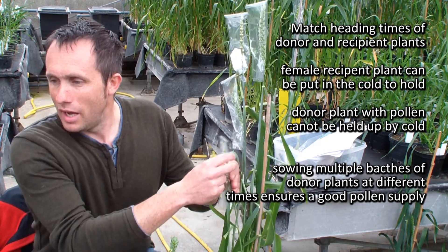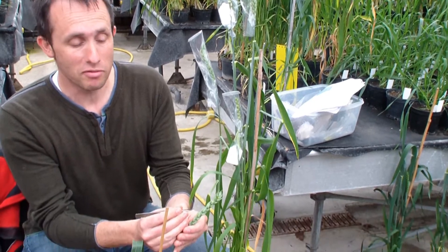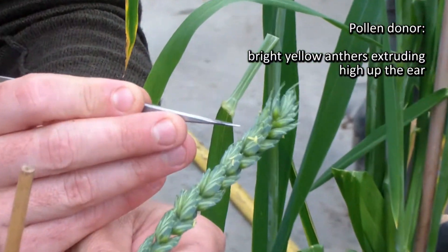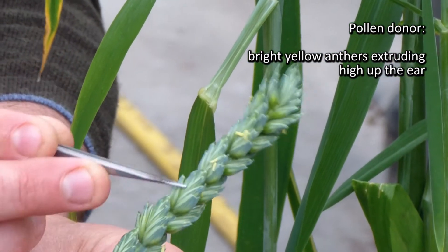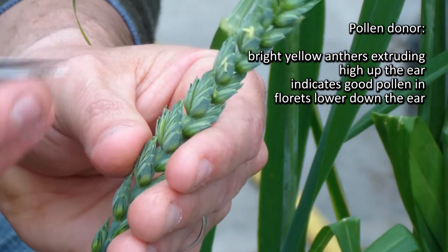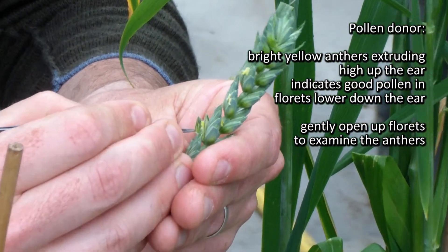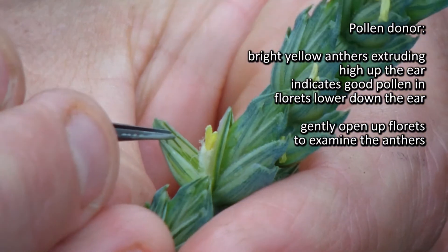So, on with your appropriate pollen donor — here it is. This is exactly what we're looking for right now. We're looking for an ear where we've got some very nice bright yellow anthers hanging out, extruding. Further down the ear we can see there are no anthers hanging out, which means we're going to have good pollen inside some of those florets. I'm going to gently open up and start looking for these anthers to use as a pollen donor.